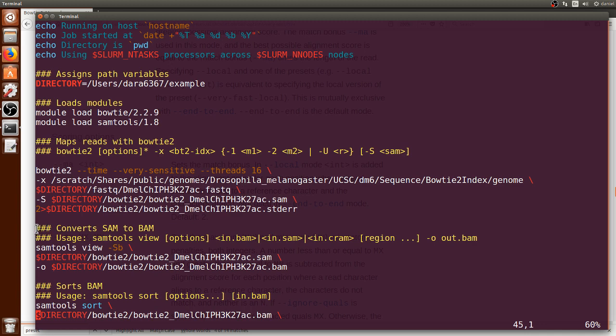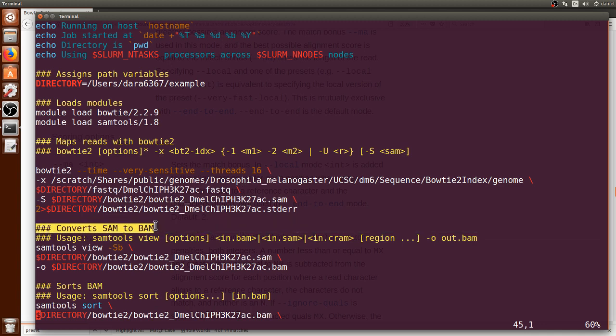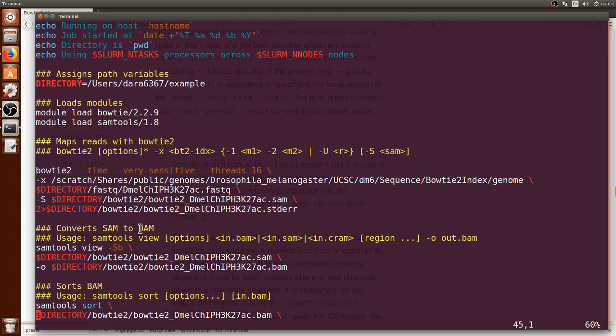And once it is done I will convert the SAM to a BAM file. The SAM is a human readable version into a binary version of this alignment which is not human readable and it's just a faster way that further algorithms need in order to process the data.